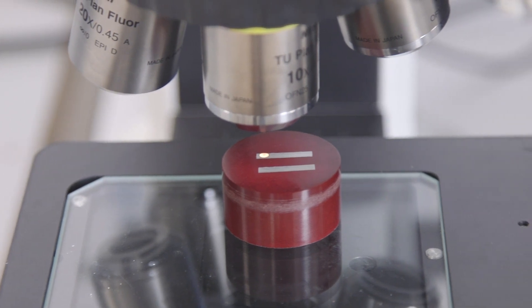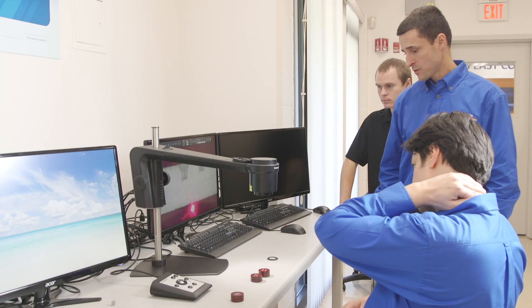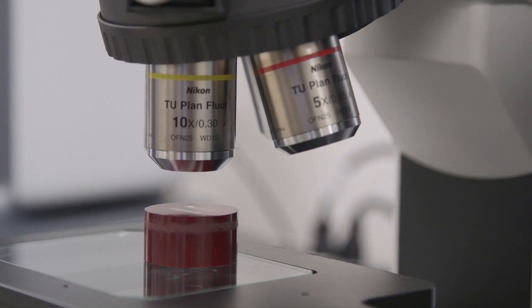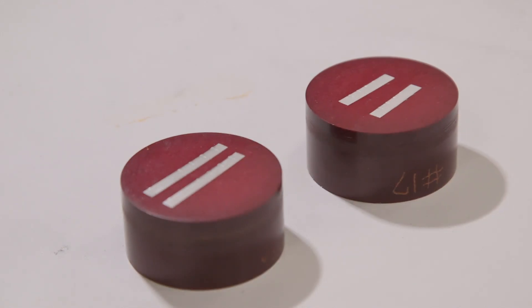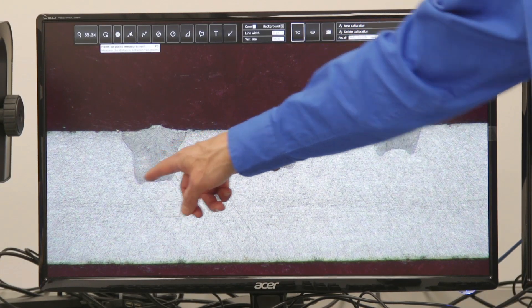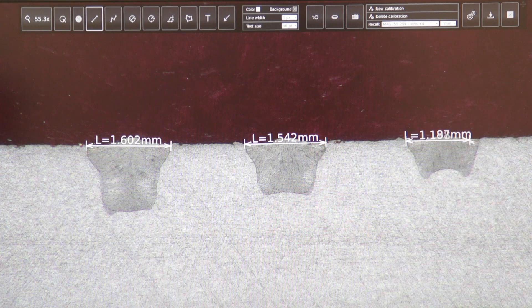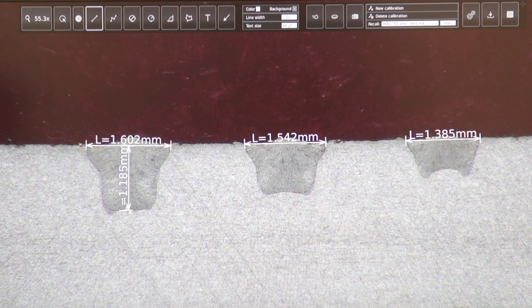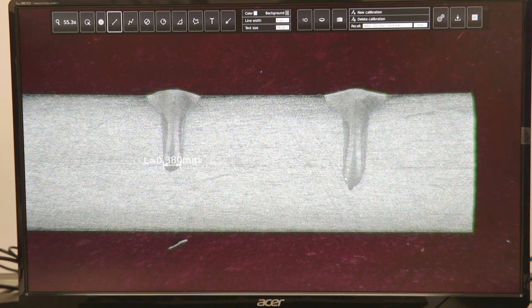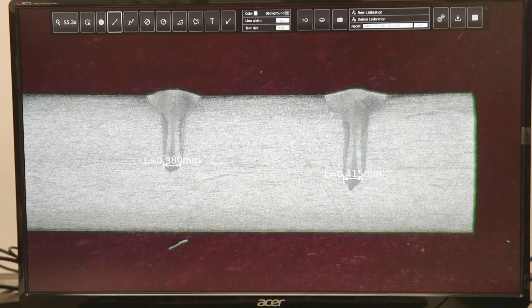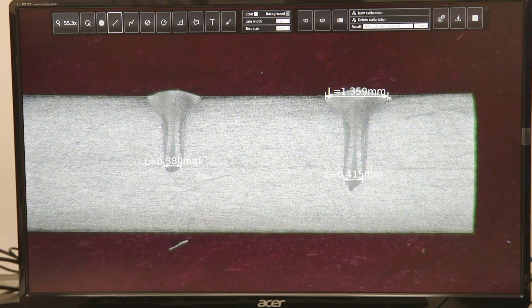In addition to weld measurements, optical microscopy is used to measure the grain size and phase area in the weld zone and heat affected zone, and to measure potential defects such as micropores in the weld zone. This is a cross-section of bead on plate welds done by the IPG wobble head. Weld measurement is often required to meet the mechanical properties of the weld part — attributes such as weld depth and width at different locations. These bead on plate welds are done with totally different wobble parameters and, as you can see, they result in a significantly different weld profile.